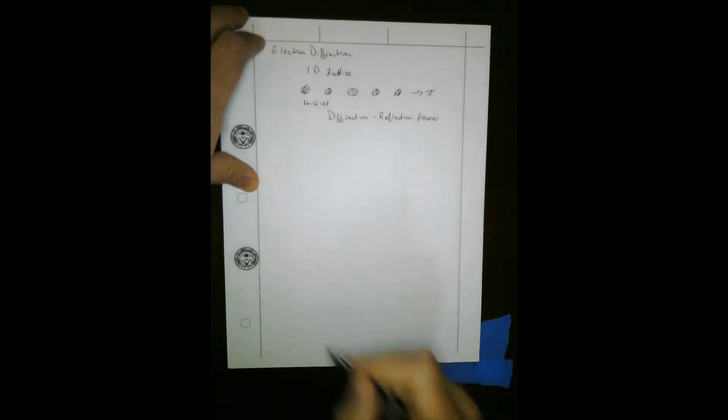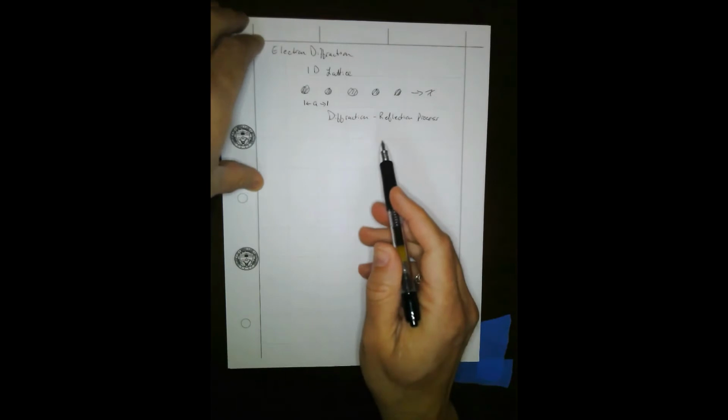We can take a look at some electrons traveling through this 1D lattice. Since we're talking about a reflection process, and even the word diffraction itself, we're talking about the electron behaving as a wave.